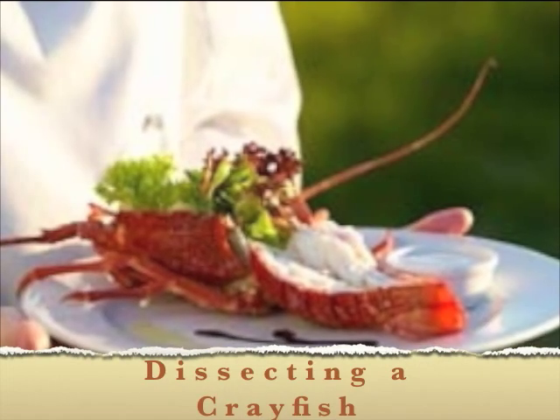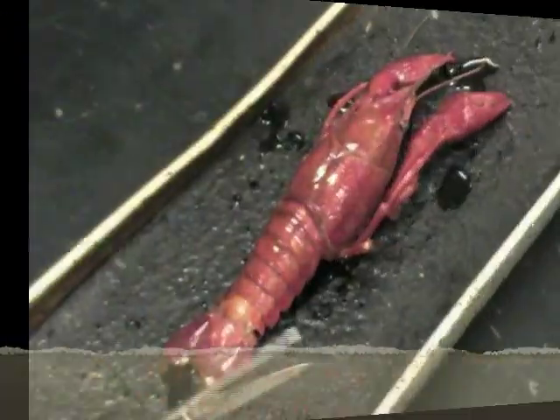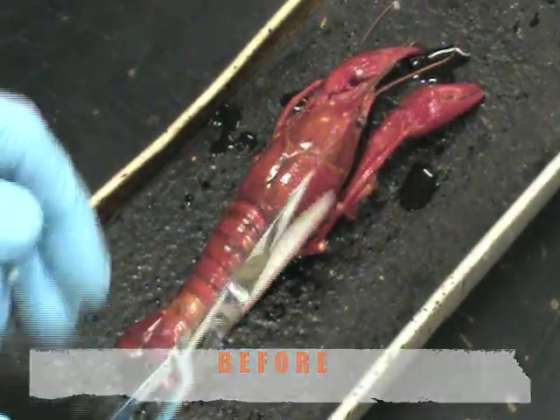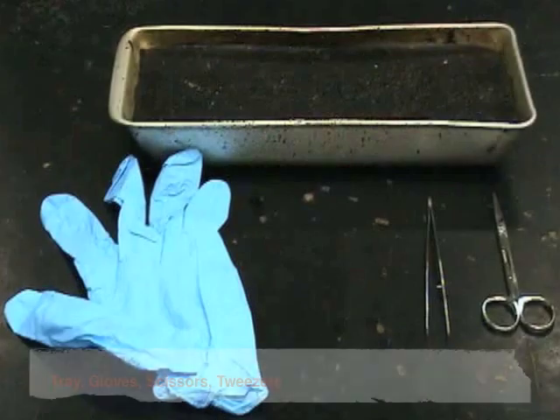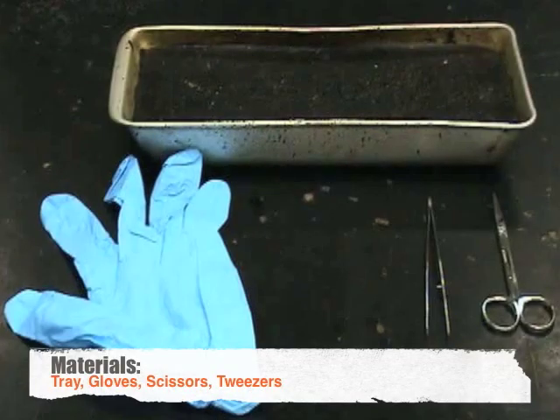Hello, this is an introduction on how to dissect the crayfish. Before you can begin, you will need gloves, scissors, tweezers, a probe, and a tray.